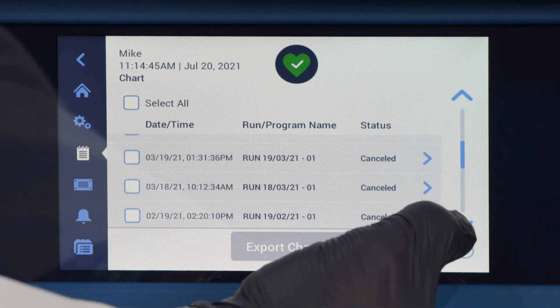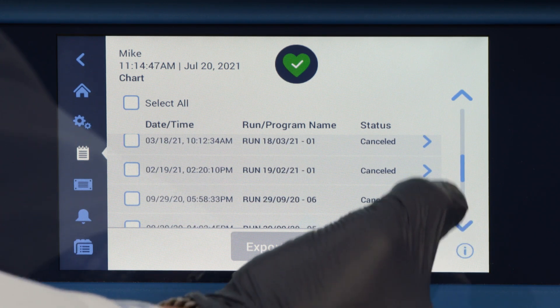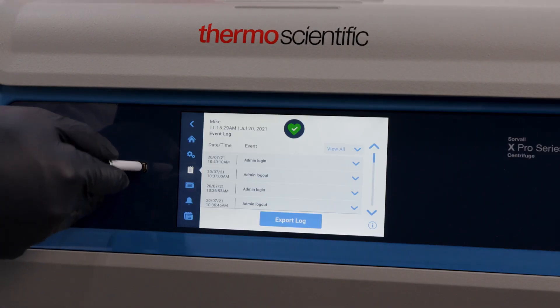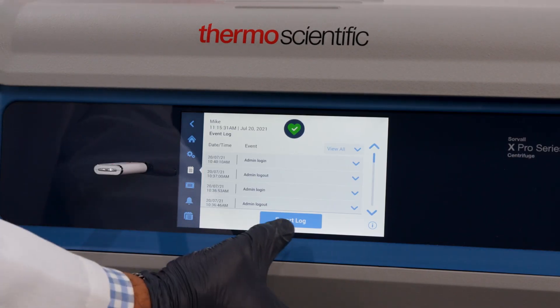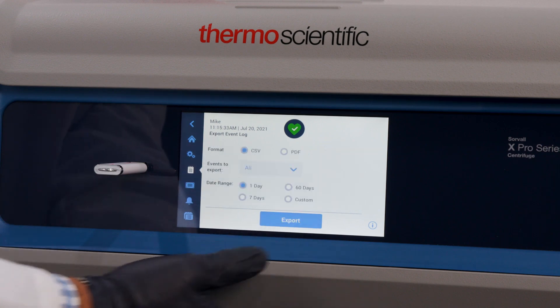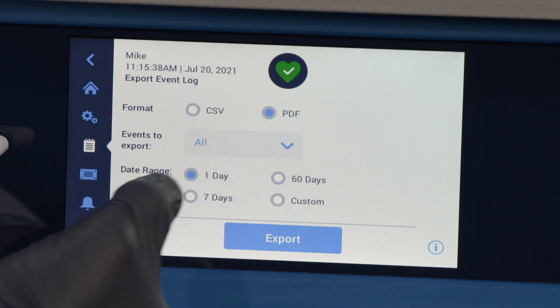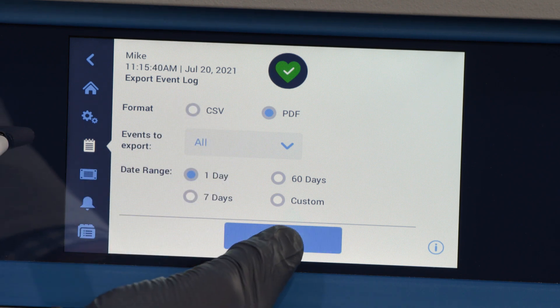The logs and charting features bank this information up to 100 runs. All this information is easily downloadable via USB, located in front of the unit, and can be used as documentation for compliance purposes. The run log data can be exported as a PDF or as a CSV file.